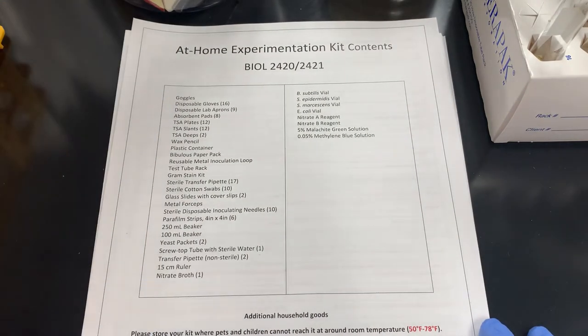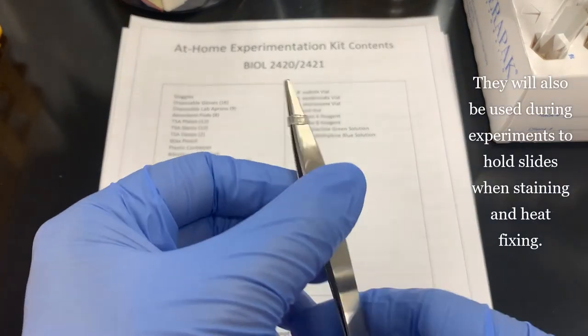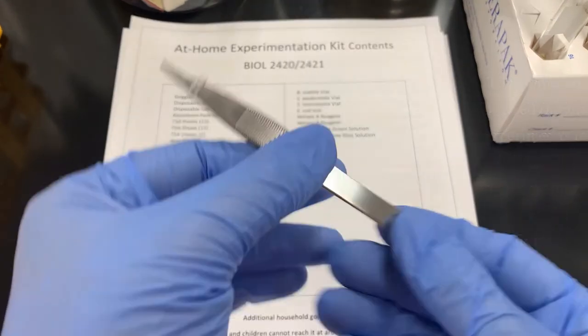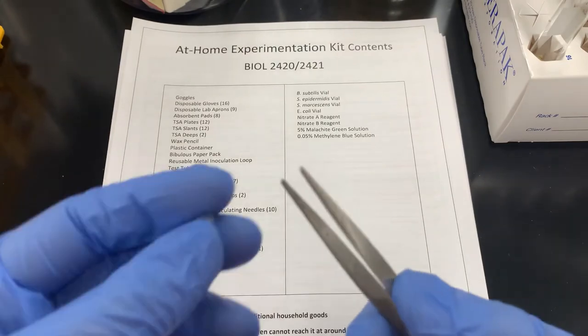Metal forceps. These are gonna be used for the antibiotic lab and disinfectant lab. Okay, you're gonna also dip these in ethanol and flame them to make them sterile. These are metal forceps. You pull off the little rubber end here. Boom, just what you think forceps are.